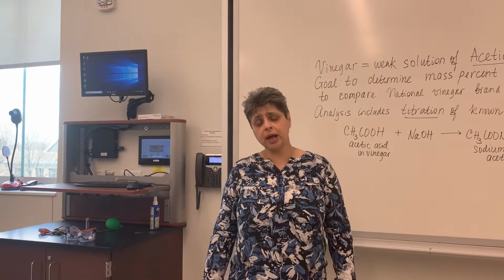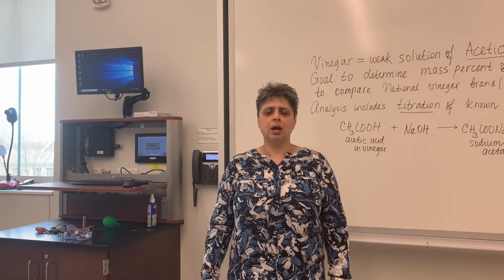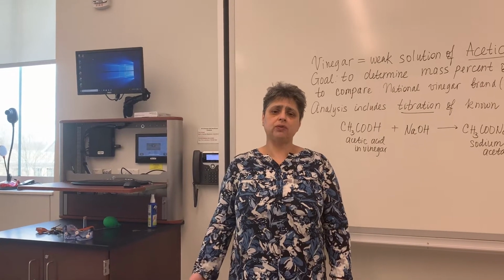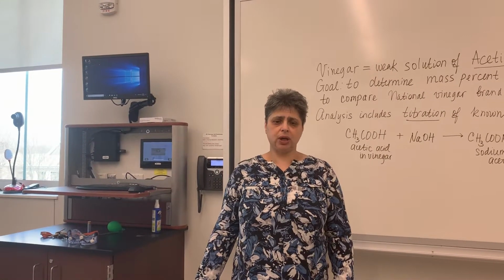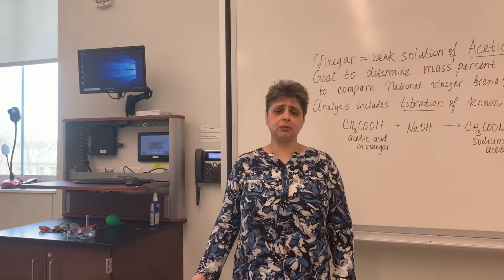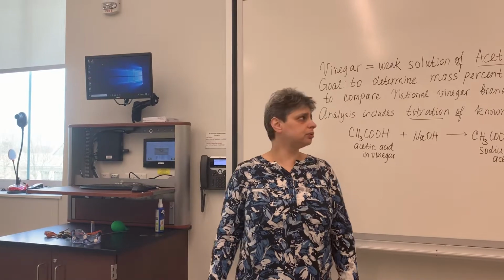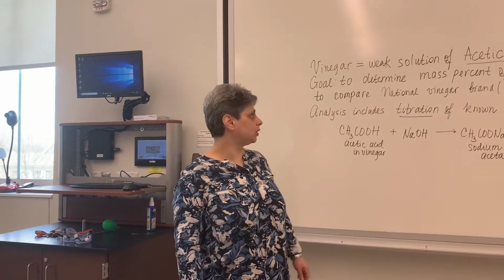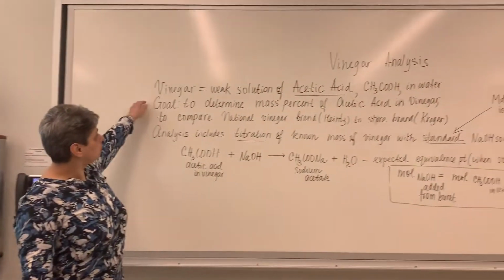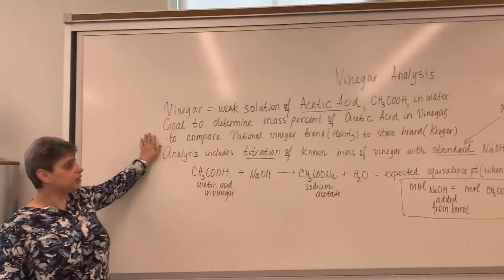So if you were in the lab here, you would have titrated KHP with NaOH, you would have found the exact concentration of NaOH. You would then have kept some of that sodium hydroxide solution in your drawer, and this week you would use it to look at vinegar. And so we begin our discussion by talking about what vinegar really is.